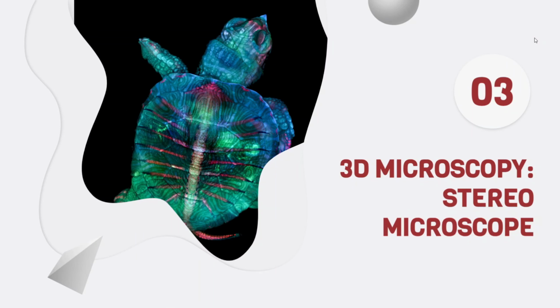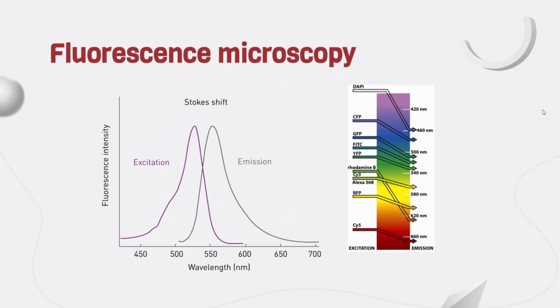Fluorescence describes how certain substances absorb light and almost immediately re-emit it. A fluorochrome is a molecule that absorbs light, so its electrons jump to a higher energy state and then release this energy as light of a longer wavelength. This difference is called the Stokes shift.